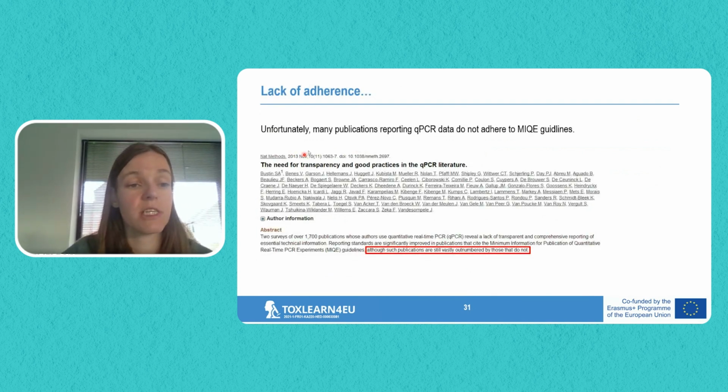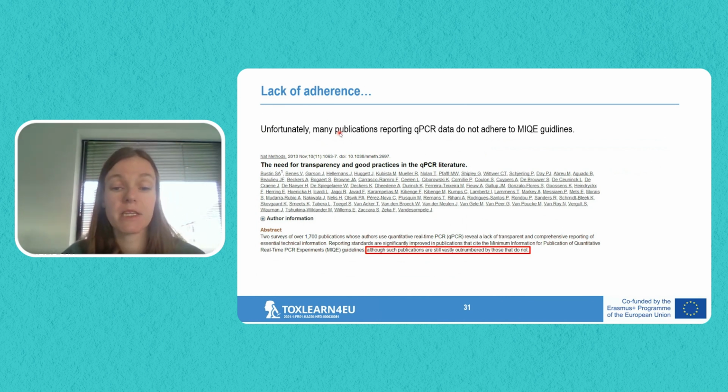But a publication in Nature Methods in 2013 showed that unfortunately many publications that report qPCR data still do not adhere to these MIQE guidelines, which is of course a very unfortunate thing, because the reason of these MIQE guidelines is for people to be more transparent on the experimental procedures that they used. And this is something that we can only encourage. So if in the future you ever publish qPCR data, please keep this in mind and please do adhere to these MIQE guidelines.